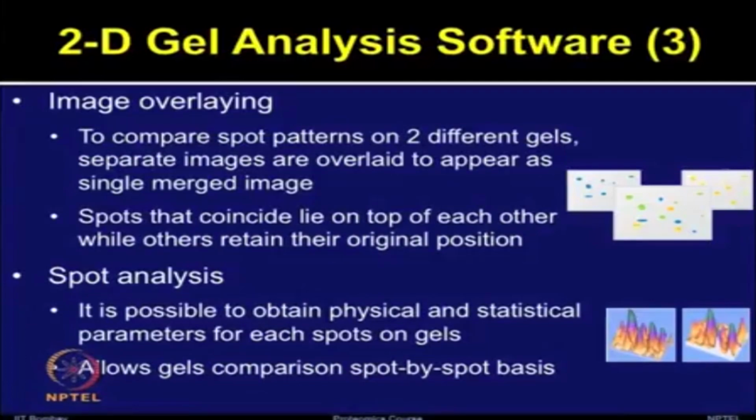Often, running a gel or acquiring images and generating a lot of data is much more straightforward compared to doing the analysis, which is a more tedious step. One has to really sit and go through the gels, usually spot by spot, to analyze them.